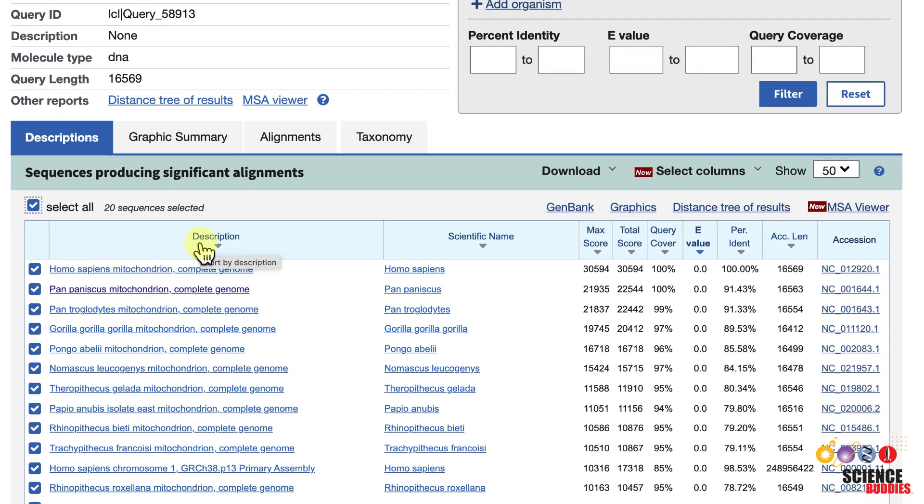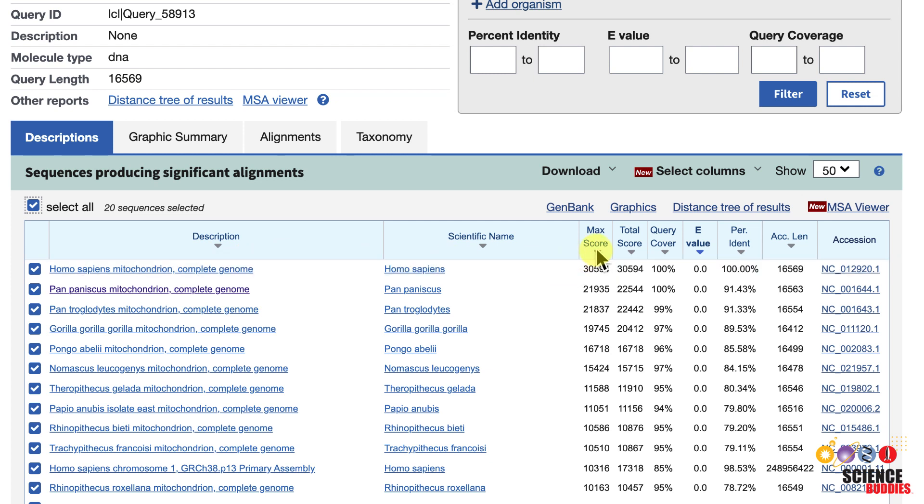The table provides following information: the description or title of the matched database sequence, the maximum and total alignment score for the database sequence, the query coverage, which is the percentage of the query sequence that is covered by the database sequence alignment, and the expect or e-value of the database sequence.